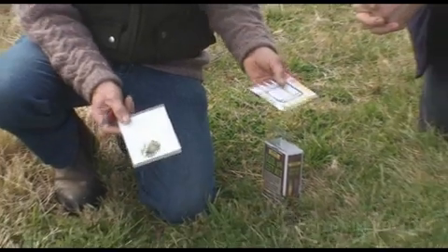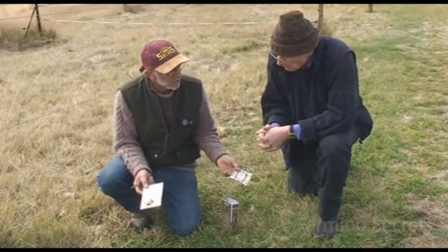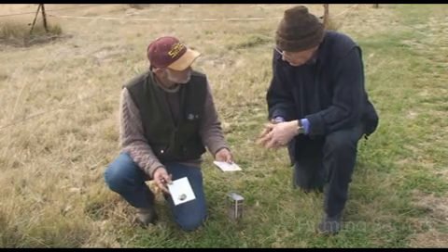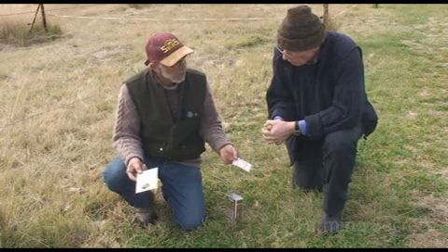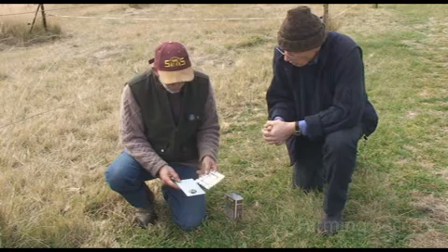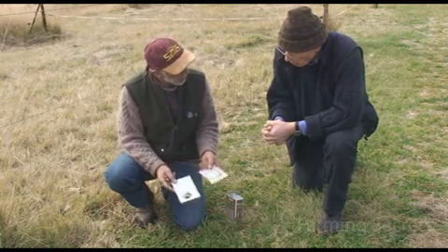It's foolproof. If you use an electronic device that relies on a buffer, you don't know the quality of that buffer. If the buffer is going off or you haven't zeroed it with distilled water, you get an inaccurate reading with no way of knowing it's wrong. Whereas this method is foolproof, and it doesn't matter if it's not to point one or point two — you just want a range.